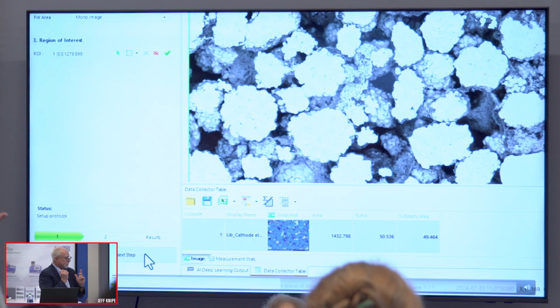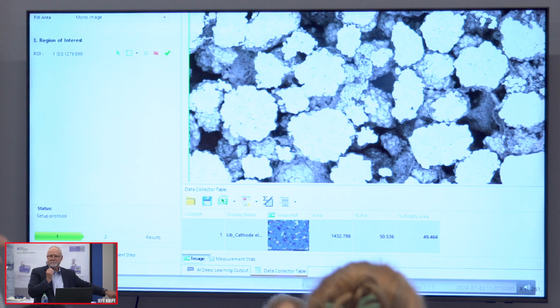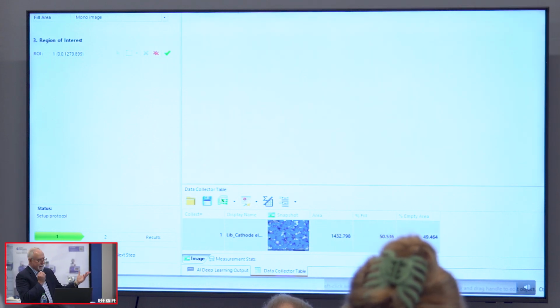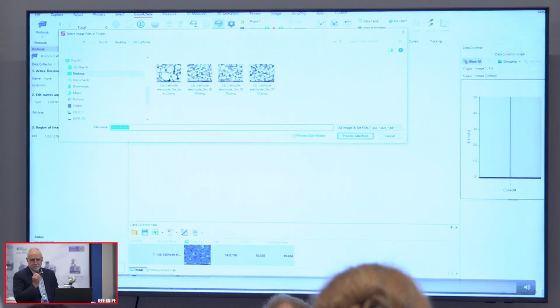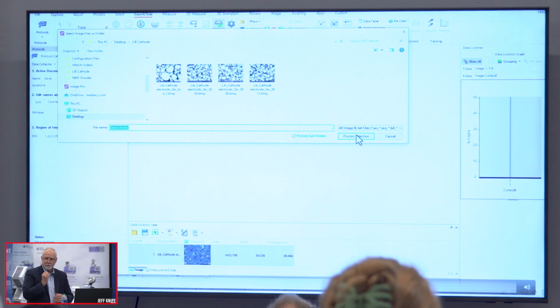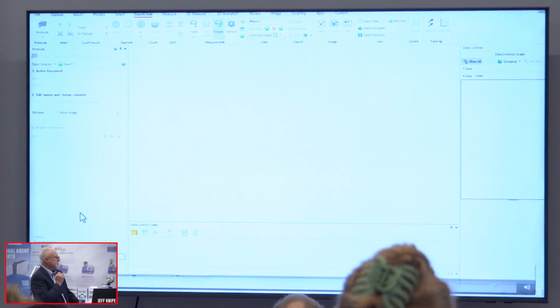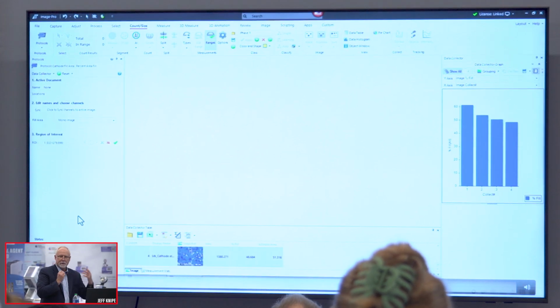And so the next step is how to run a batch process. So right now I'm in the interactive state. So it's literally stepping through, verifying your settings. Taking out the interactive state, now I can select a folder, for example, or if you're doing anything with optical fluorescence, you can actually process the multi-well plate. Here I'm selecting a folder, 4 images, and it'll sequentially process each image and then generate that data. And then with a snapshot included, you can verify that your results are correct.